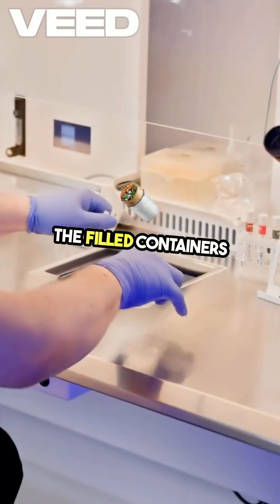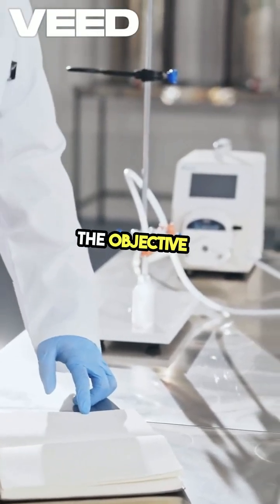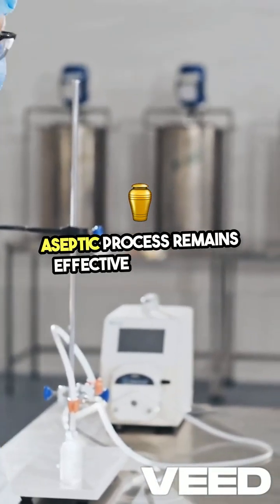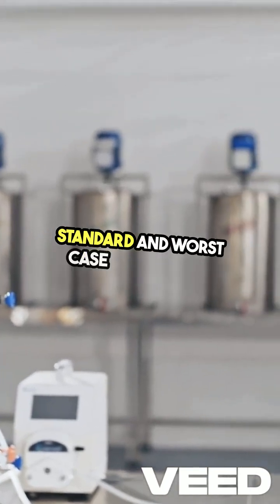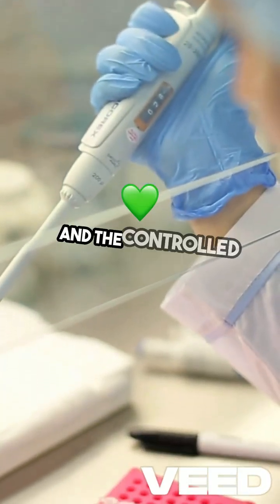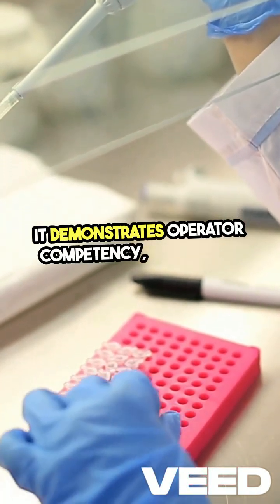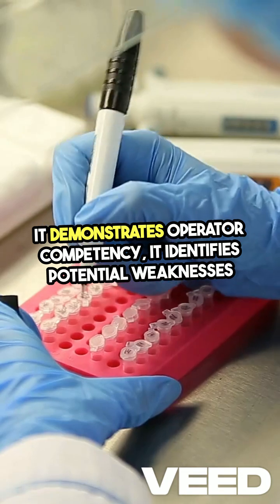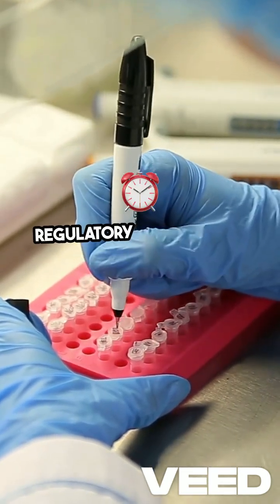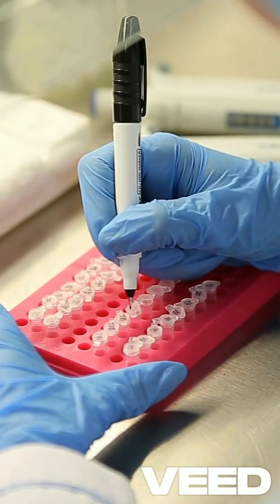The filled containers are incubated to detect any microbial contamination. The objective is simple: prove that our aseptic process remains effective under both standard and worst-case conditions. It validates the aseptic process and the controlled environment. It demonstrates operator competency. It identifies potential weaknesses in procedures or equipment. And importantly, it fulfills regulatory expectations from the FDA, EMA, and Schedule M.